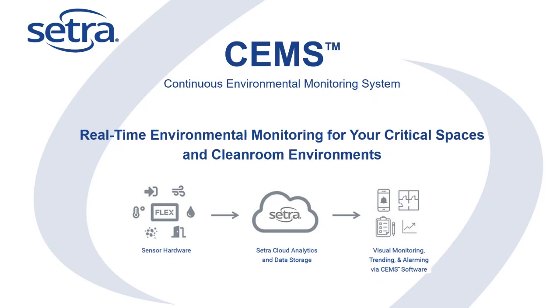Along with data visualization and alarm notifications sent via SMS text or email, CEMS stores sensor data, alarm events, and audit logs for streamlined compliance reporting. As I mentioned a minute ago, CEMS is designed to be adaptable and can easily accommodate site-specific needs. There is no restriction on what parameters can be monitored with CEMS, but the most common include pressure, humidity, CO2, particulate counts, air velocity, occupancy, door status, and door counts.